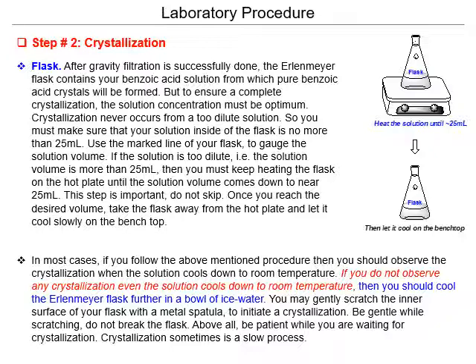Also, something you can do is, if you have some reference benzoic acid just lying around, you can use it in a process called seeding. You put a very minute amount of the crystal in, so that you don't mess up your measurements, and it will probably initiate crystallization.